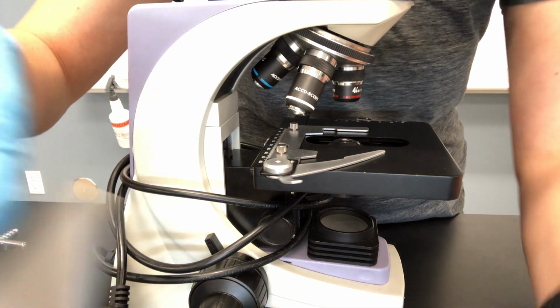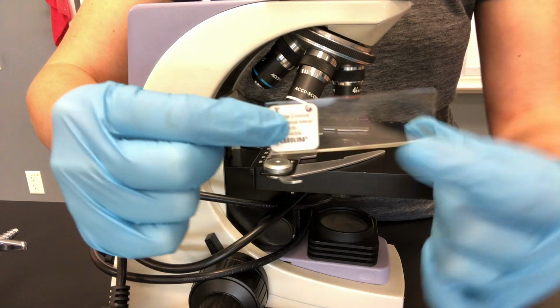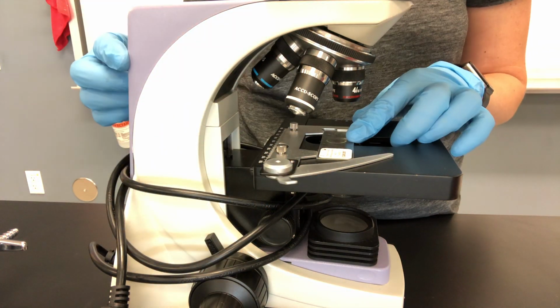Ooh, it's a typical coccus, something that you guys are going to be looking at. So this is our prepared slide. It's got a label, it tells you what it is, and the specimen is right in the middle. So when you're ready, you can put your specimen right on that slide clip.